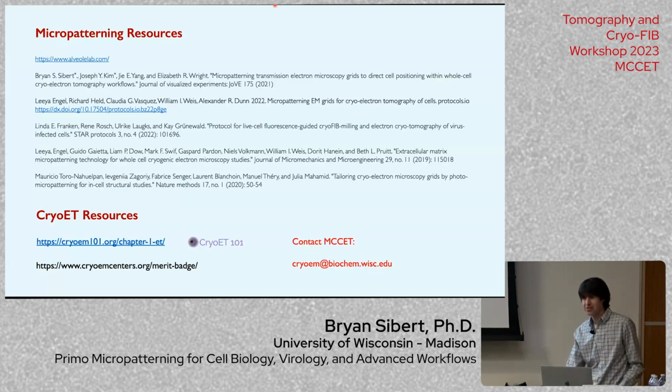Why glow discharge? We do want the proteins in the FBS and media to adhere to the grid, so I think the glow discharging helps with that. And also just getting the grid into the media. If the grid is hydrophobic, it'll want to float and flip over. So glow discharging just lets you soak it more easily. If you were able to soak the grid in the media, by overnight it would be hydrophilic just from having soaked. But the glow discharge is really a convenience at that point.